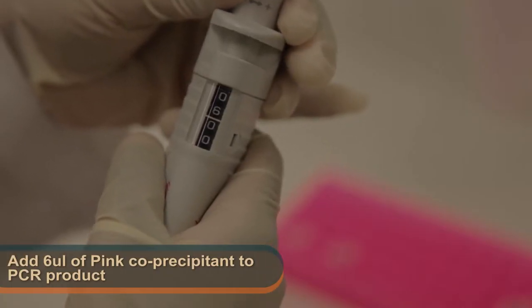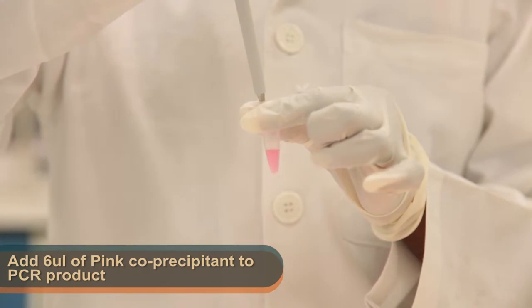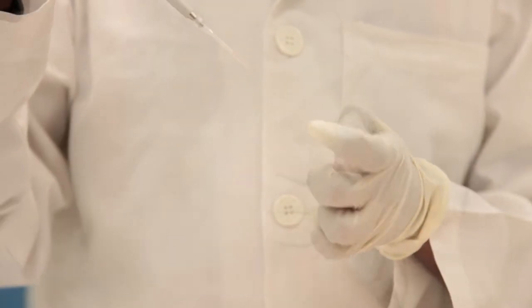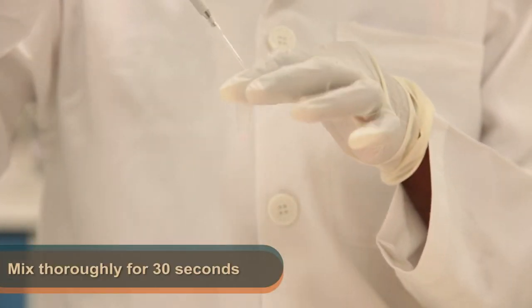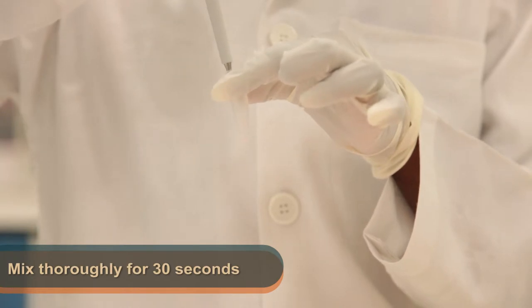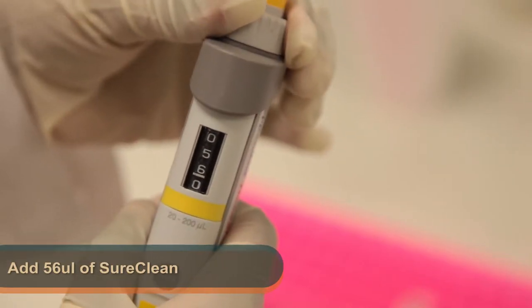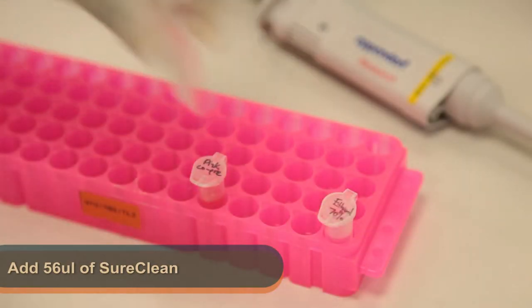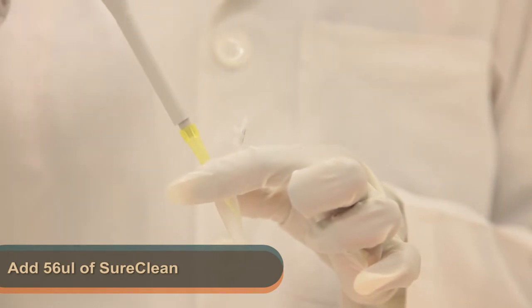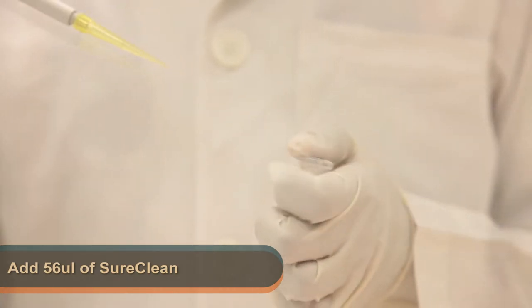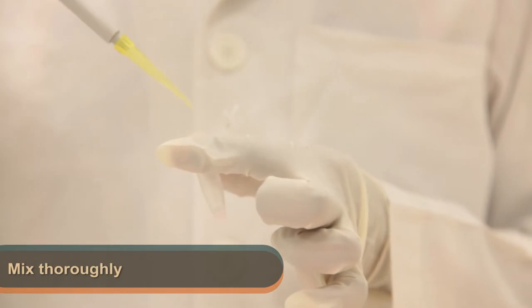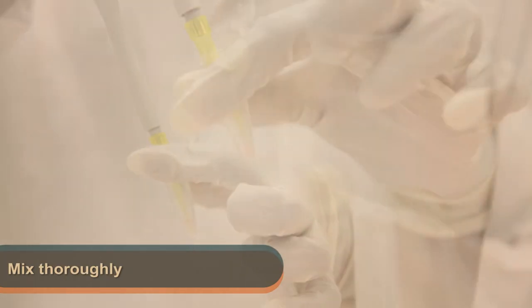Firstly, add six microliters of pink co-precipitant to the PCR product. Use the micropipette to mix the solution by pipetting thoroughly for 30 seconds. Next, add 56 microliters of sure clean solution to the PCR product. Use the micropipette to mix the solution by pipetting thoroughly for 30 seconds.